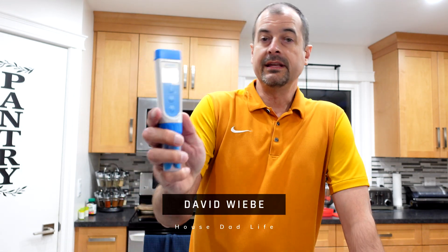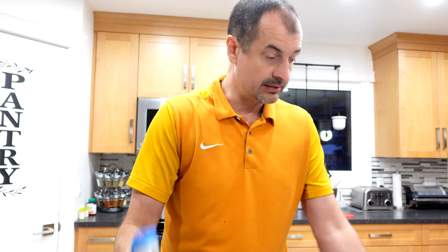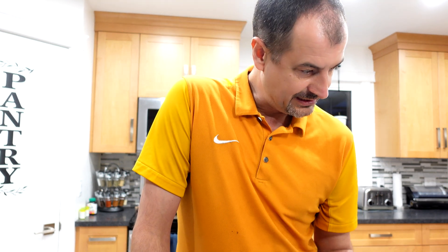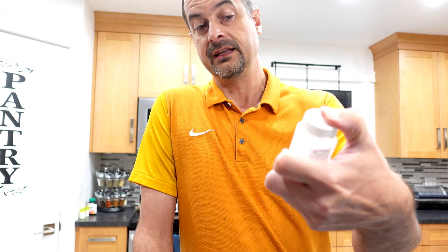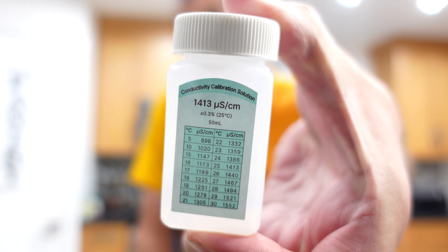So if you just picked up one of these EC meters like I did, and you're wondering if it needs a calibration, it does not according to the instructions. And if you want to verify it, we can do that because I'm going to be doing mine. You just need the EC or the 1413 µS calibration solution.